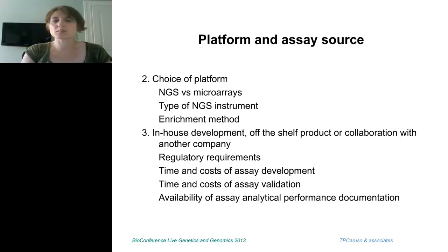And as I mentioned before, the actual development of an assay is a huge issue for some labs because of the regulatory requirements. They need to meet them. They need to be sure that they can run this assay tomorrow, in 6 months, and in 5 years, that the regulations will not force them to change the assay again or suspend performing the assay because of how it was originally introduced.